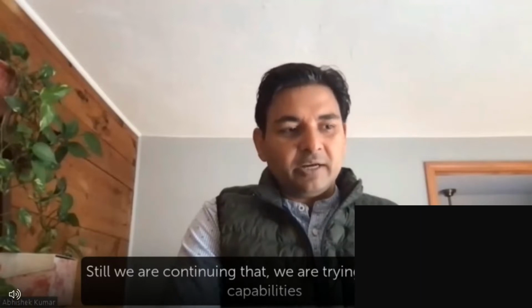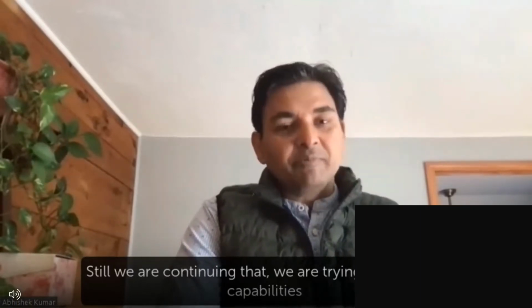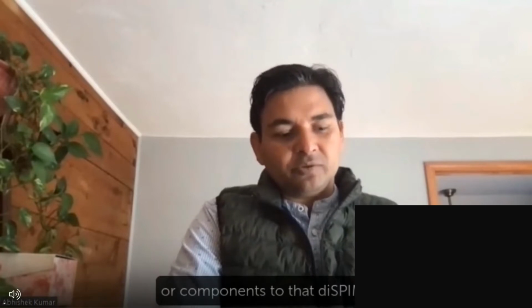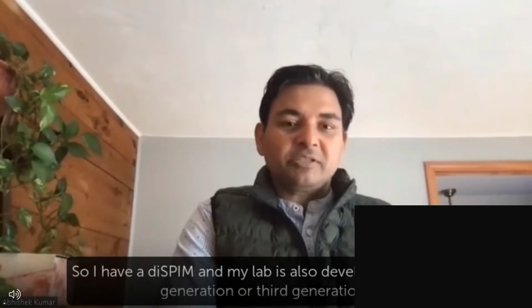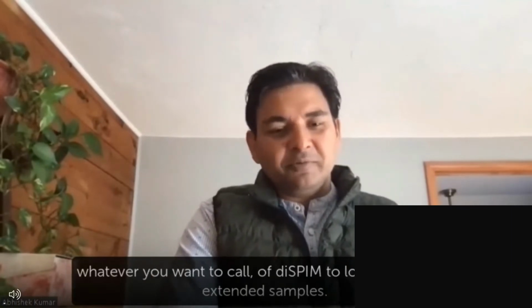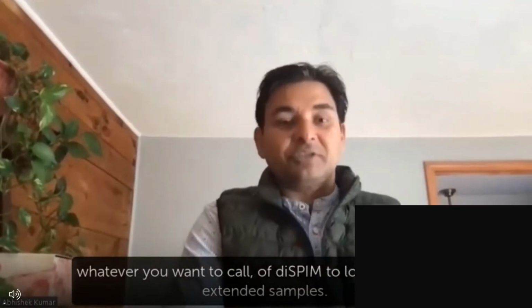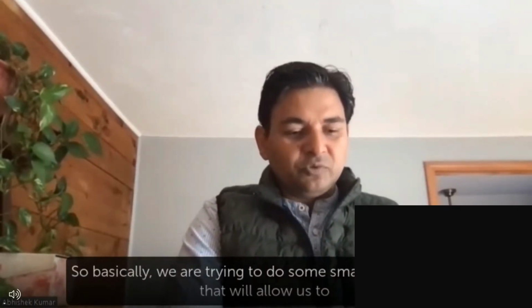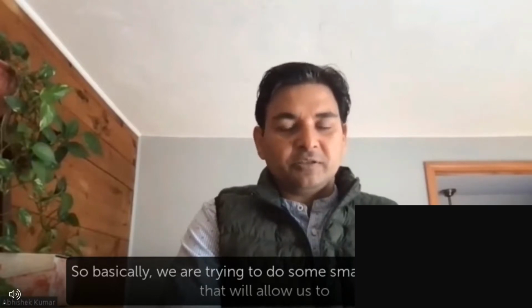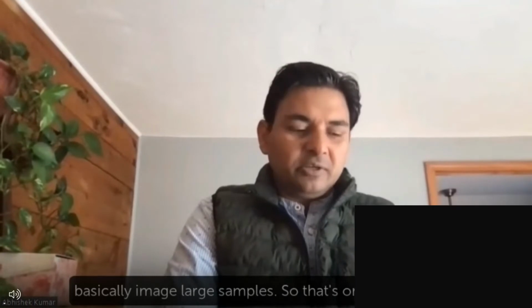We are trying to add small capabilities or components to that diSPIM. So I have a diSPIM, and my lab is also developing a 2nd generation or 3rd generation, whatever you want to call it, of a diSPIM to look at large and extended samples. So basically we are trying to do some small modifications that will allow us to image large samples.